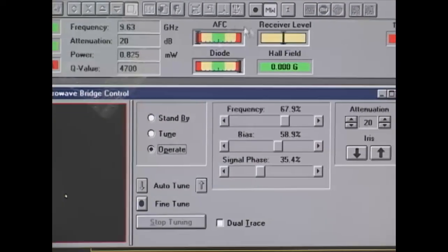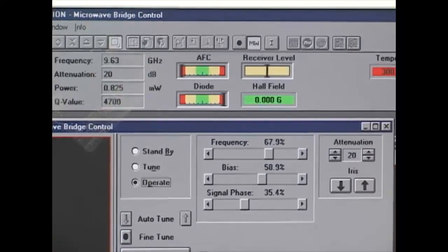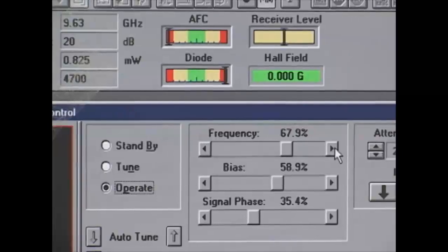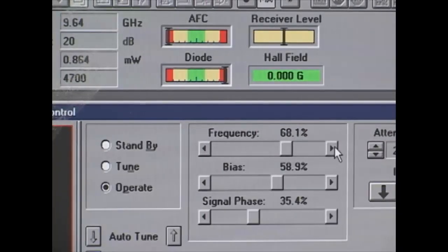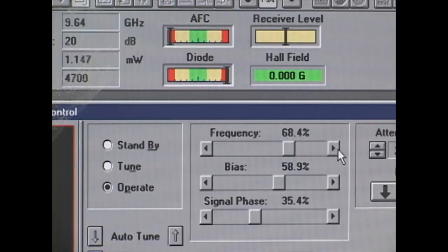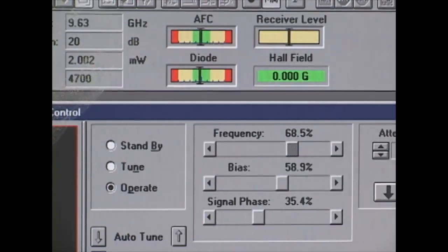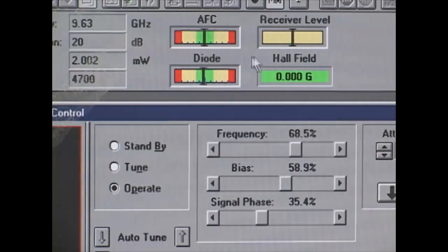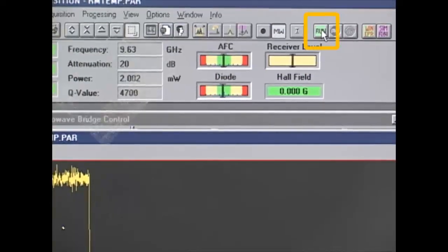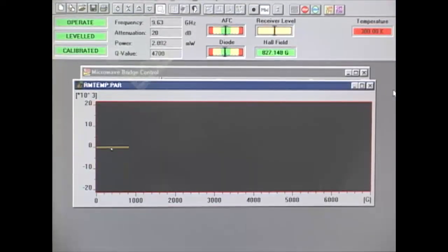The goal is to get the AFC, diode, operate leveled, and calibrated all in green. We do that by moving the frequency, which controls the AFC. Now that we have AFC, diode, and calibrated all in green, we can click run to start recording the signal.